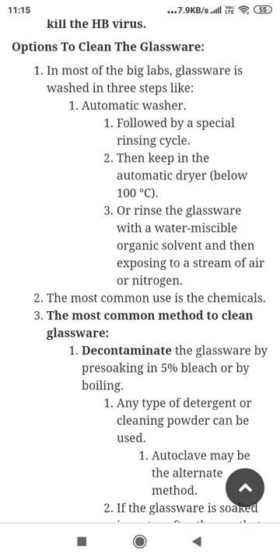In the automatic washer, we fill water in the washer by switching on the button. After that, we will heat. What happened?